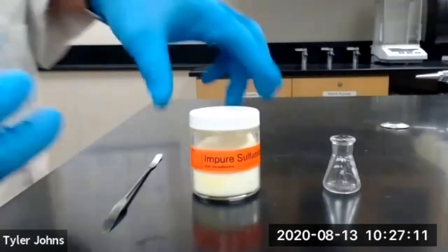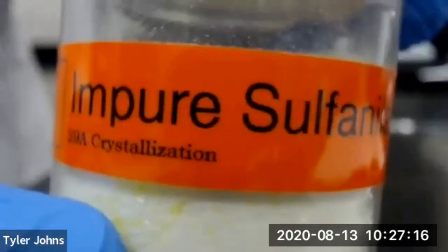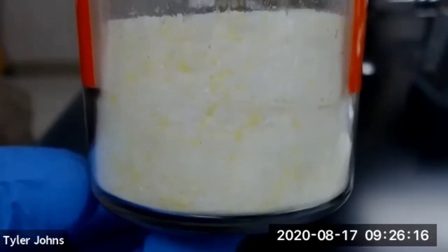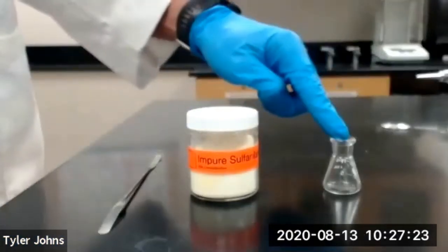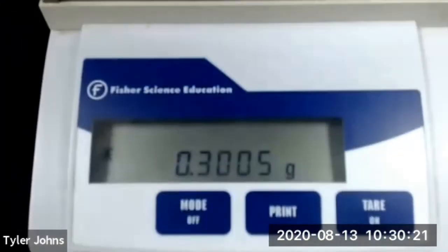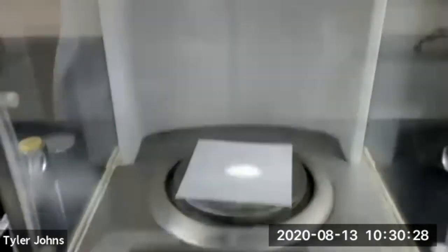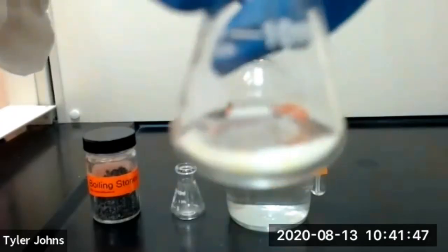The first thing we need to do is weigh out 0.3 grams of impure sulfanilamide. Note the color of our impure sulfanilamide and transfer to a 10 milliliter Erlenmeyer flask. The mass of our impure sulfanilamide is 0.3005 grams.